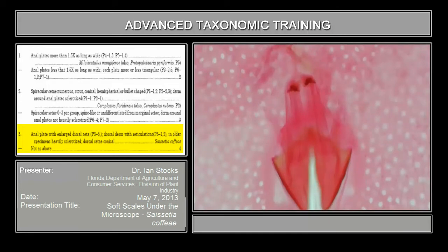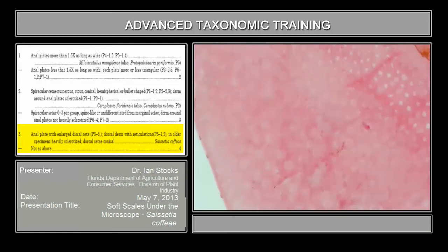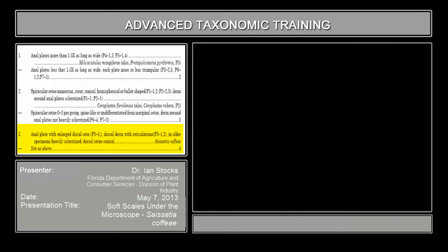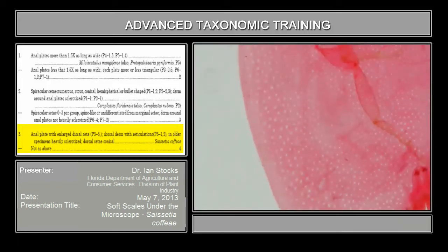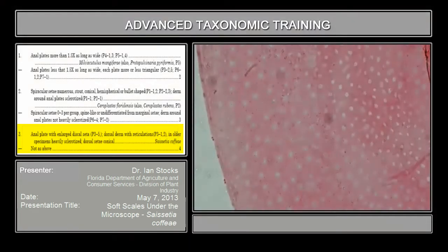We've already done the tibiotarsal sclerosis, but since we've talked about ducts, and it's important to develop an appreciation for duct morphology, what we'll do is we'll go off to maybe halfway towards the margin from the legs. You'll pick up on another band of ducts. So let me pull out of the magnification here a little bit. There we go. So it's going to be around in this region here. All right. So go up to the next power, the 10x. And now I can go hopefully here and pick up on it. And for comparison, the image is going to be again plate 3, but this is figure 3.